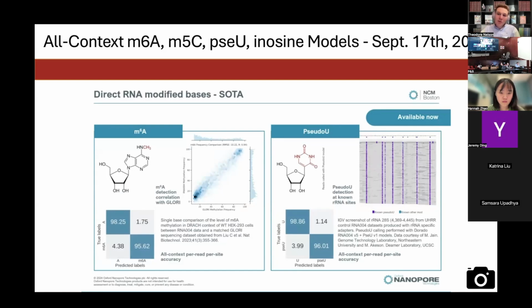And that m6A will be present in 100% of the molecules at that specific site. And they use that for A's as well to basically have their negative and their positive controls. And they generate these per molecule accuracies for the different models.